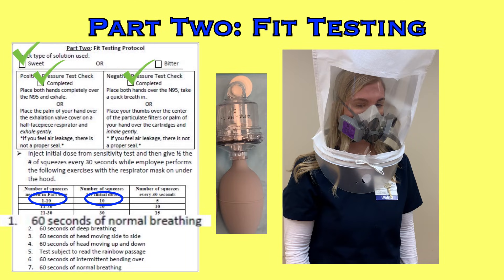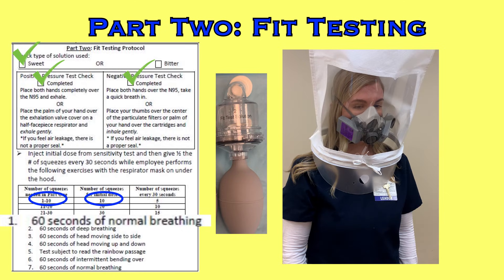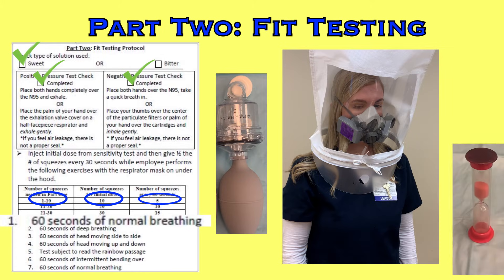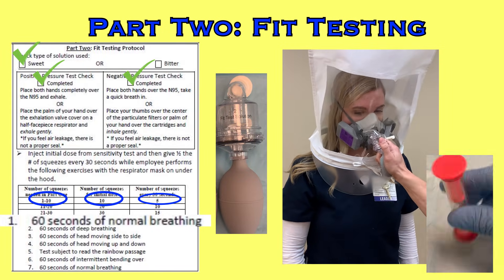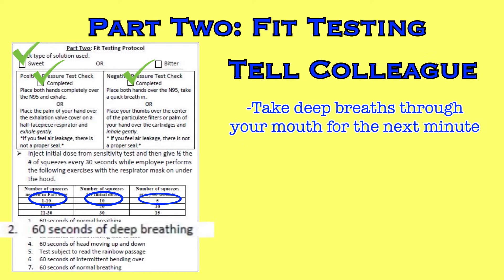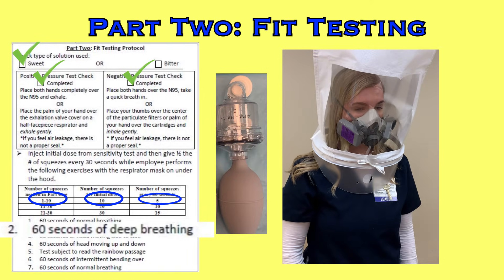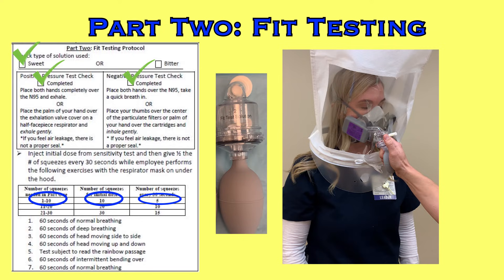Step 1 is to breathe normally for 60 seconds — that step has already started. When your 30-second timer finishes, squirt the indicated number of additional squeezes into the hood (for this colleague, 5 squeezes every 30 seconds). Once squirted, restart your timer and repeat when the timer runs out. Then flip your timer and tell the colleague: 'Now take deep breaths through your mouth for the next minute.' After 30 seconds, squeeze more additional puffs into the hood. After a minute, squeeze again and move to step 3.